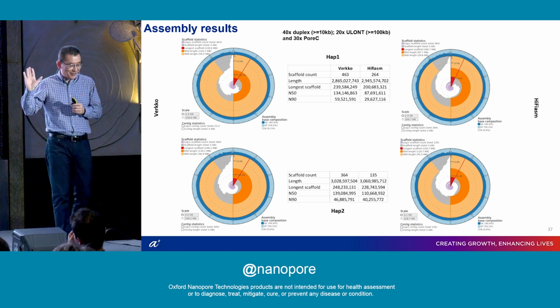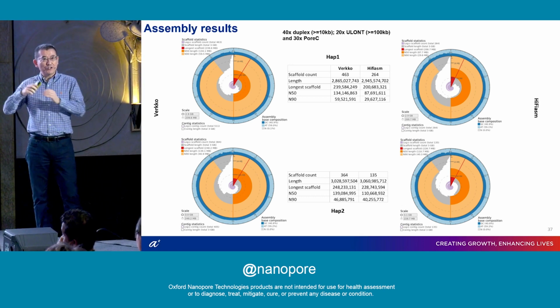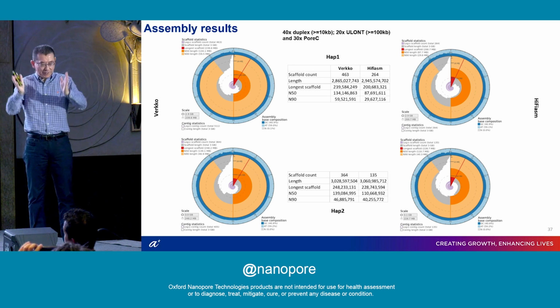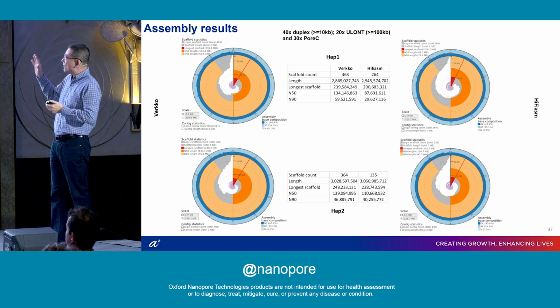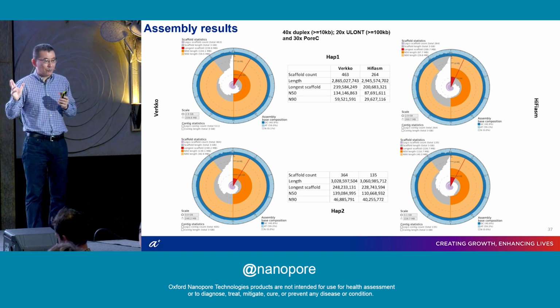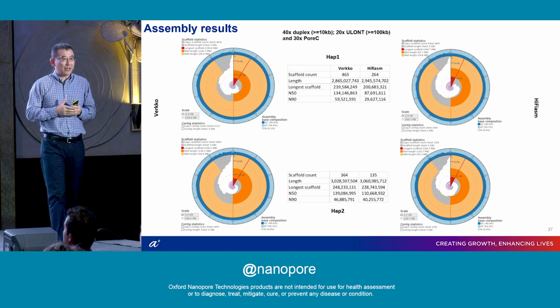That'll be more strict. It basically tells you how many scaffolds or contigs you can generate using two algorithms, Verkko and hifiasm. We present results for HAP1 and HAP2, which represent two pools of contigs. They are called phased contigs. You can see the size is roughly close to the human genome size. As a reference, for CHM13 it's about 2.96 for HAP1 and 3.05 for HAP2 in terms of the length of a human genome. So in terms of overall length, it's very similar.